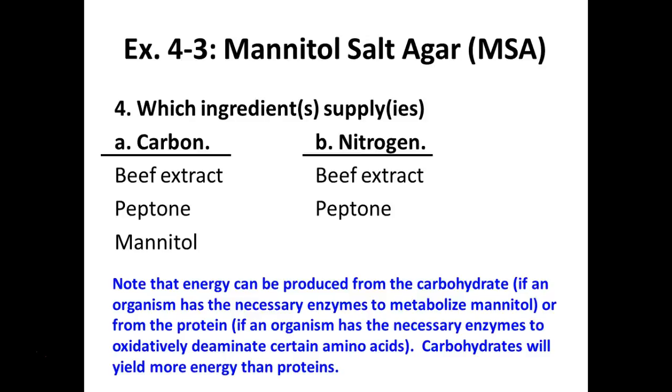But in the absence of sugars, or in the inability to break down a particular sugar, the organism can get energy from proteins. And that's the case for Amber's organism. Yours prefers the protein, right, and turns that media alkaline. You get those bright pink colors. And again, sugars yield more energy than proteins do.